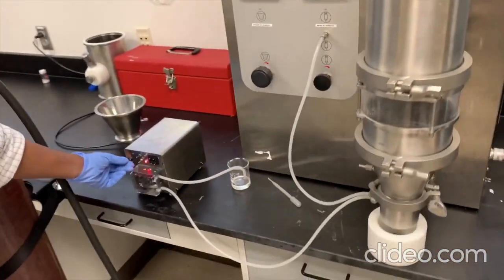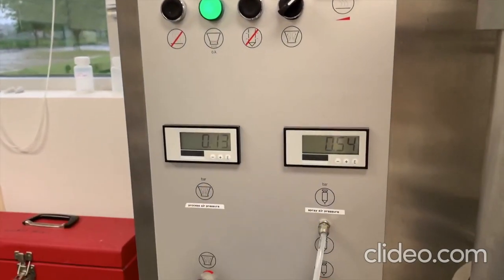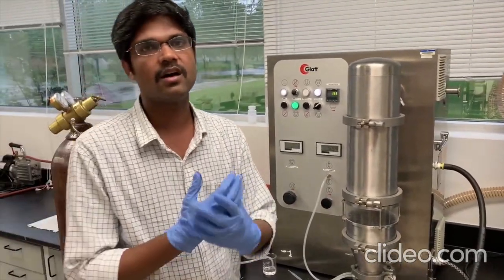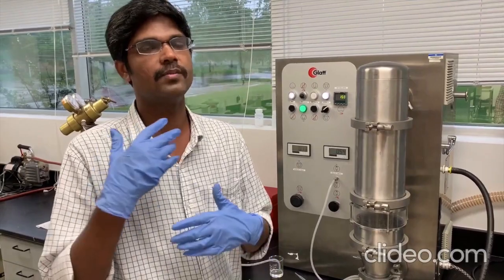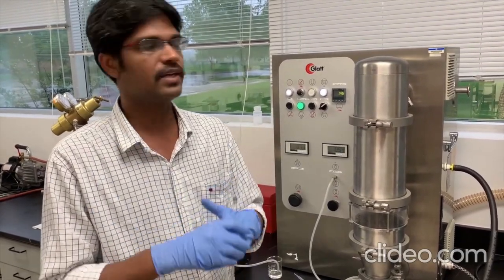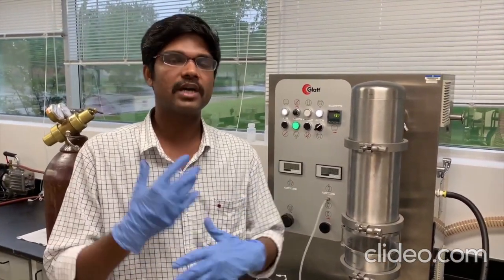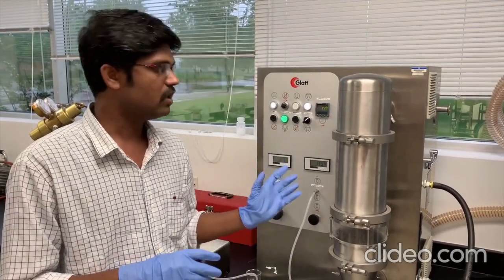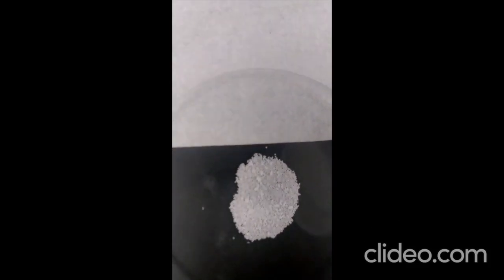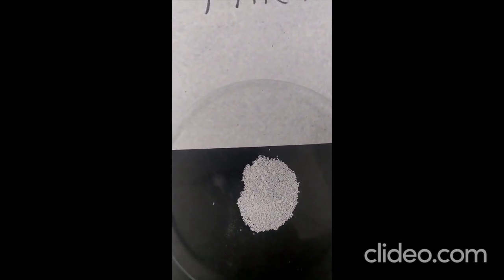Once the peristaltic pump has been connected and everything is fit, you can see that the flow of compressed air and the spray has started, and now the coating process has started. Generally, this process takes place for 5 or 10 minutes, depending upon the material and polymer we use, the microstructure we need, or how much thickness we need; we can tune our coating process. If we want the coating to have some color, then we can use some pigment. Once the coating process has been completed, these materials are generally dried in the oven. We can see that the particle size has increased and it has been coated with the polymer which we have used.